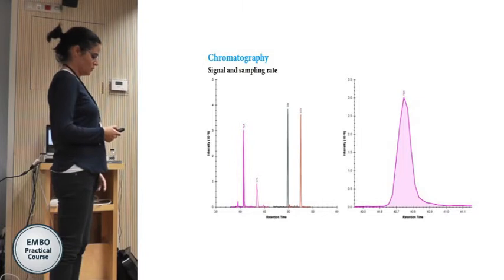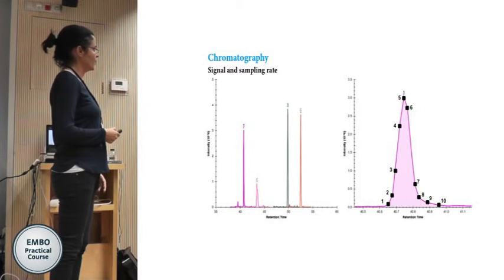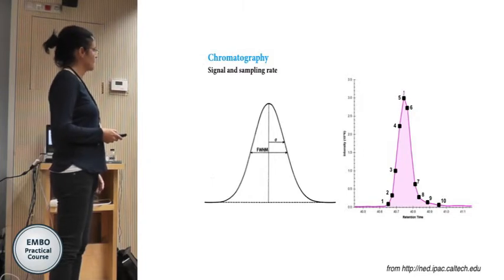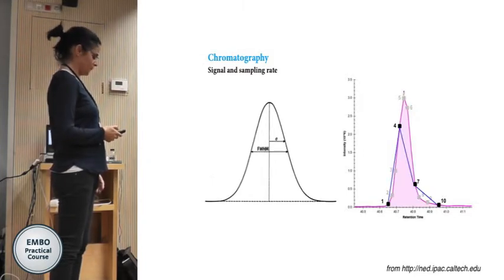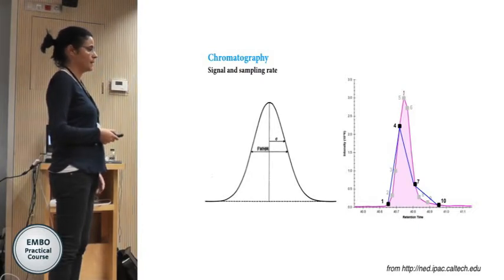The signal is not continuous — it is made by joining several data points. In this case we have 10 points in the peak, which is good enough, but this depends on the width of your chromatographic peak. With only four points the reconstruction is not good enough and the quantitation we will obtain will not be reliable.